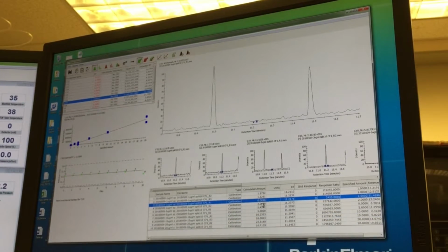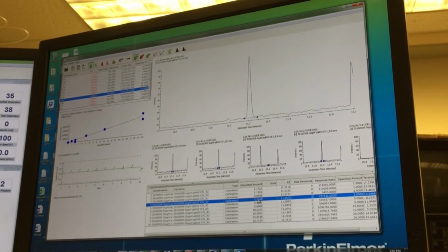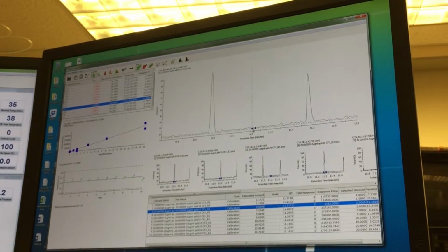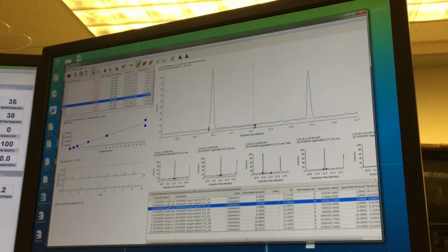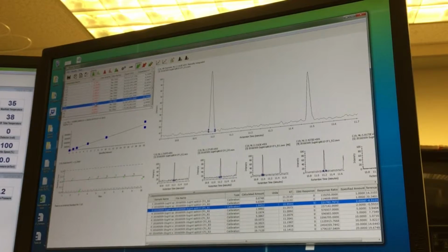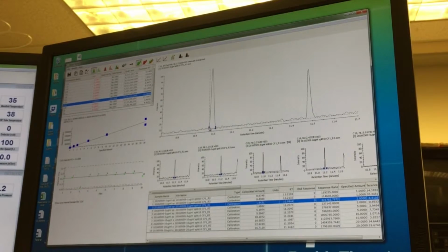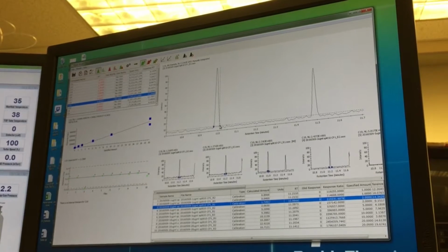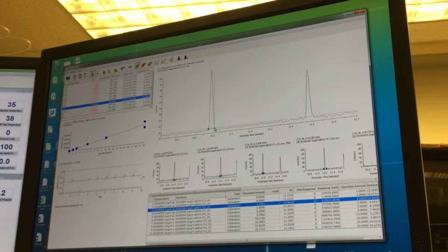Then choose here. You see this is completely off. If you see here R1, this is completely off. That means you need to delete this one, or you should choose this point. Now you see it has changed, the calibration point now is 0.96. So it changes every time. For my case also, at first I ran it, it gave me one result, not this poor result, I got like 0.9 something or 0.8 something. Then I did some manual integration and got a good result.